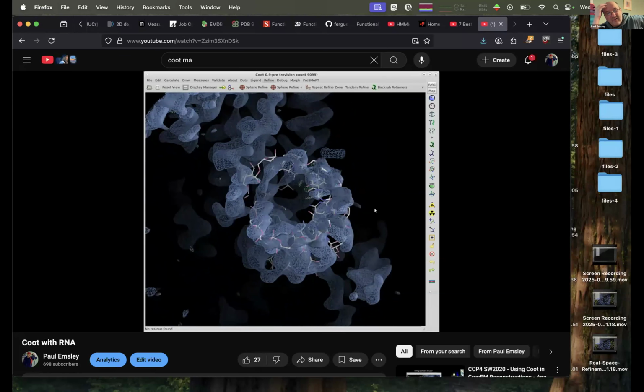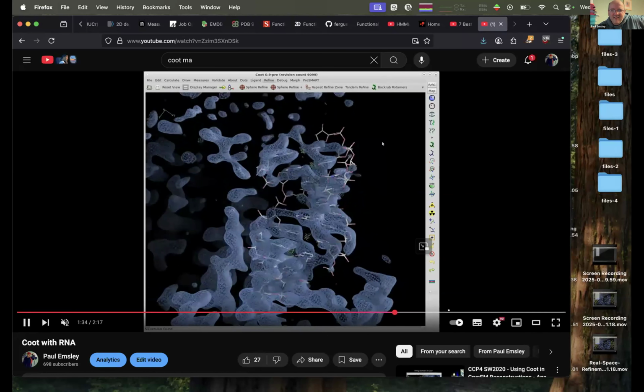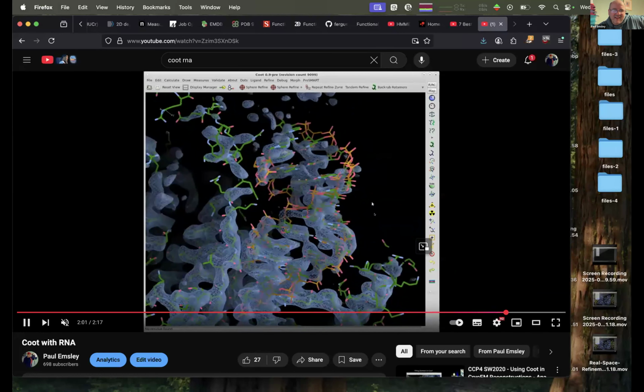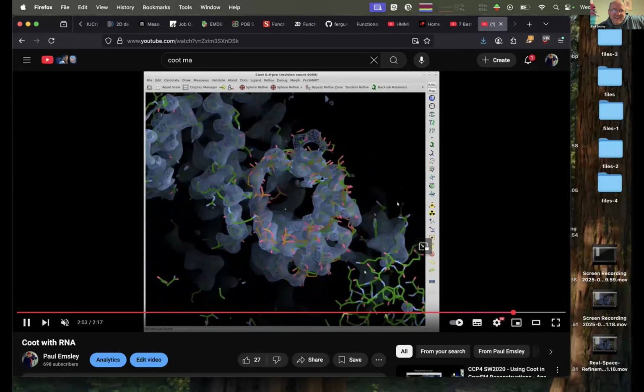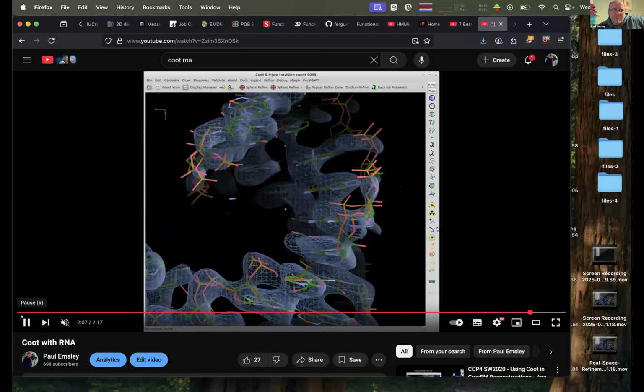And this is all interactive as well. So if you wanted to yank it, to use the technical term, if you wanted to refinement, then yeah, you can do that. There you go. So now it's fitted. And then if we compare it, you can see. Right. Okay. That's what I wanted to show you.